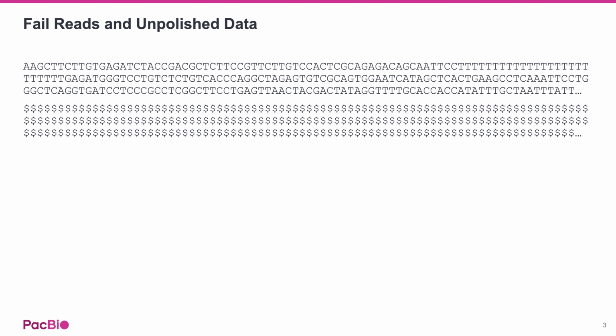In unpolished PacBio data, such as the fail reads BAM files that come off the Revio and Vega instruments, the individual base quality values are all placeholders. The instruments do not attempt to judge whether a single pulse of light from a single base incorporation event will empirically match up with the base in a given reference, as there's not nearly enough data to do so.